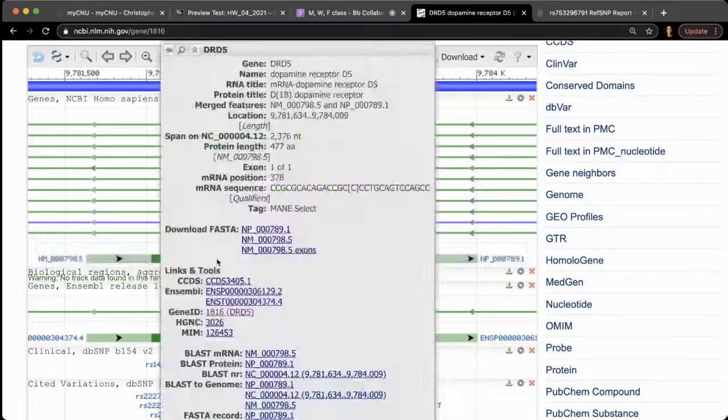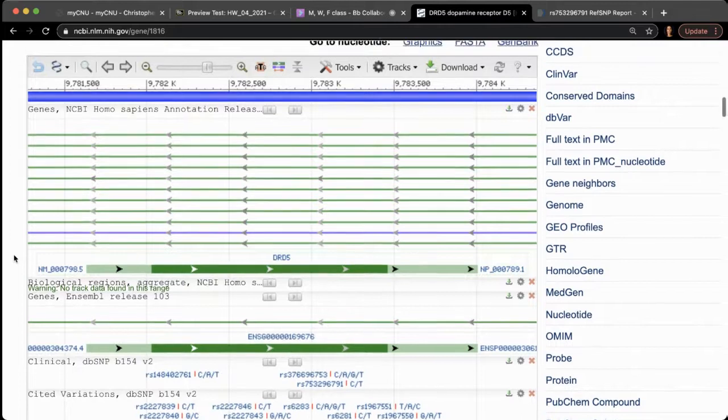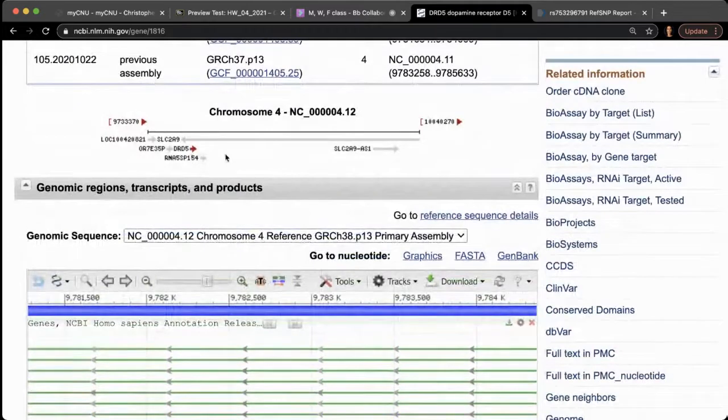This is the gene I'm interested in because that's the one in the question. And then the arrows pointing left are confusing, because you might think, isn't this gene encoded on the Watson strand? As we saw, it's pointing that way, which means it's encoded on this strand, which means the numbering should go up as it does here. If I was looking at this other gene, then these numbers would be flipped. They would be going down, because this program flips it for you so that it's easier to see.